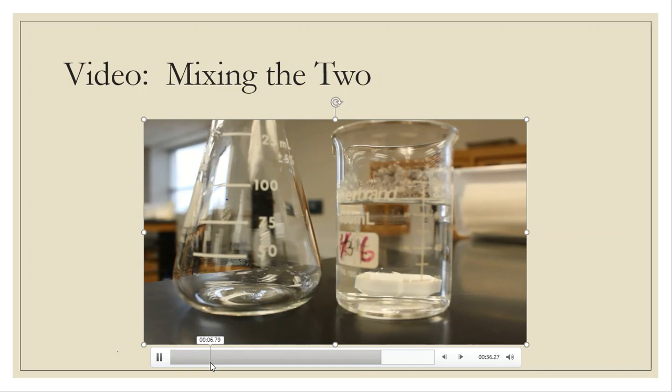I'll let this process just sit for a little bit, and it tells me to cool it to 30 degrees, which is room temperature. So at 30 degrees, I'll then put it into an ice bath. Okay, so it somewhat cut me off. I'm getting ready to put it into an ice bath once it gets to 30 degrees.